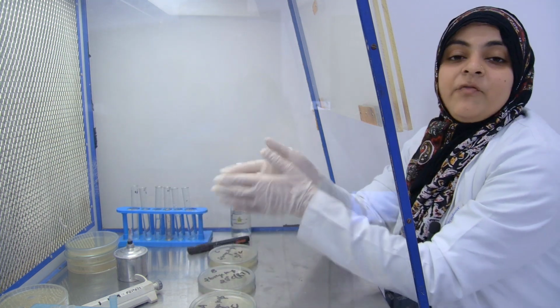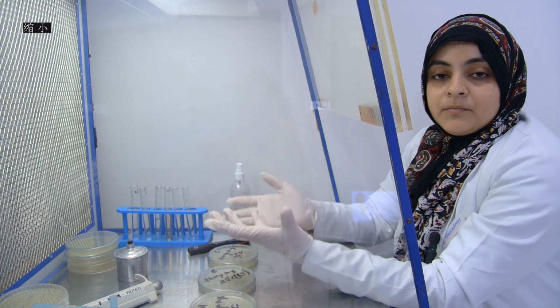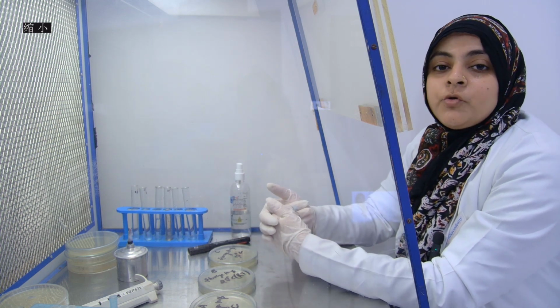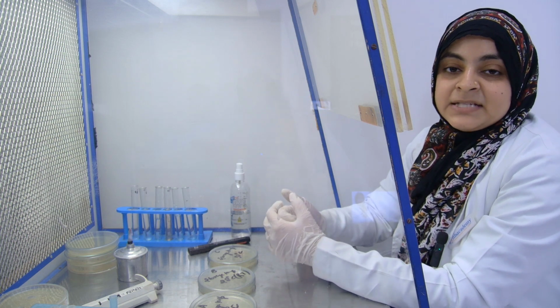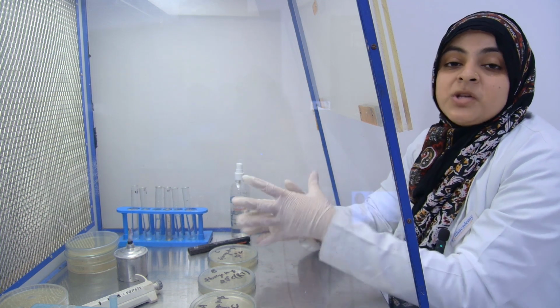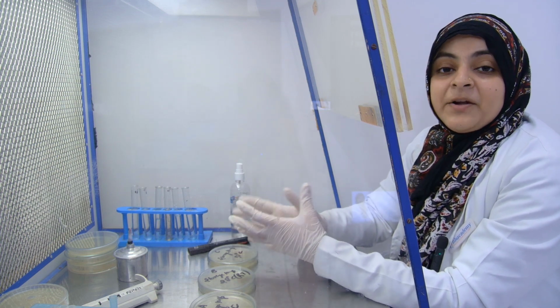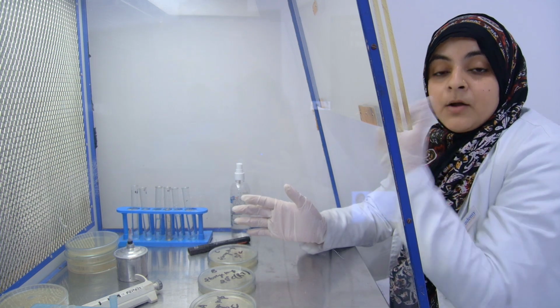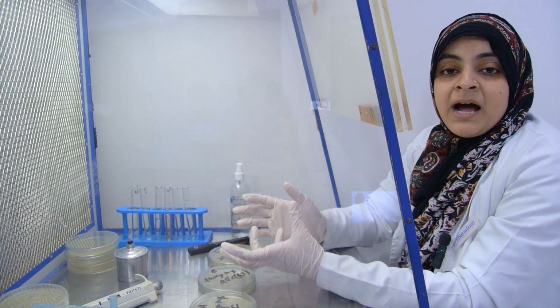Now at the end of the video, I will attach the image related to this experiment, which shows you that the first Petri plate which was kept at 5 degrees Celsius does not show any growth, but in the B Petri plate that we kept at room temperature, a few microorganisms' growth is observed.